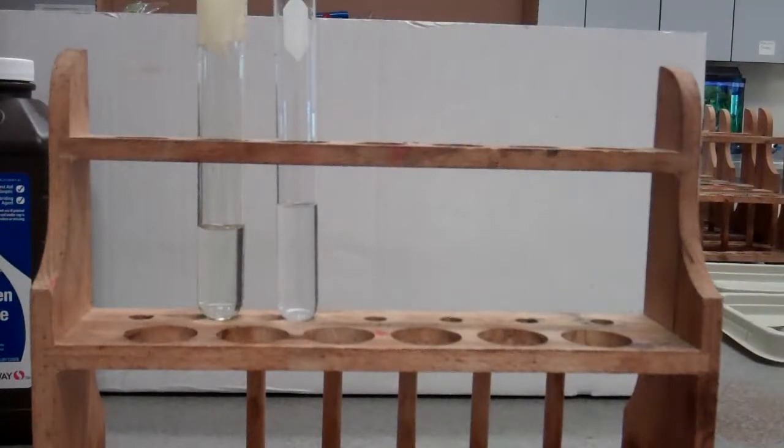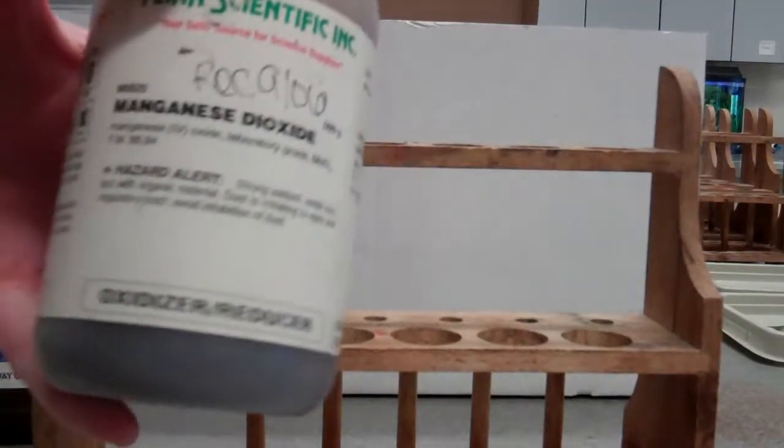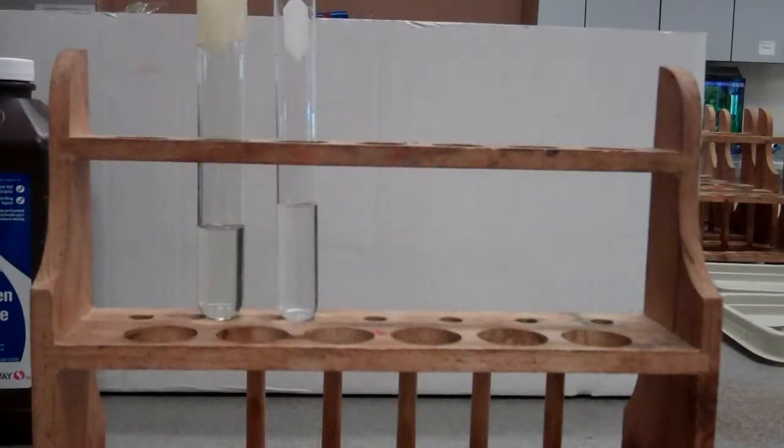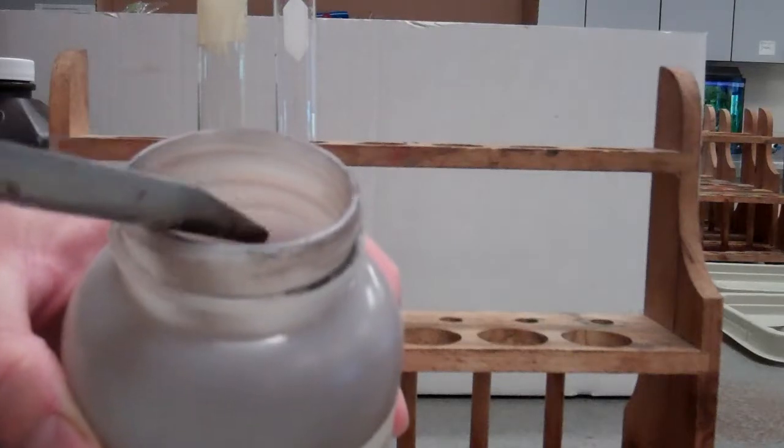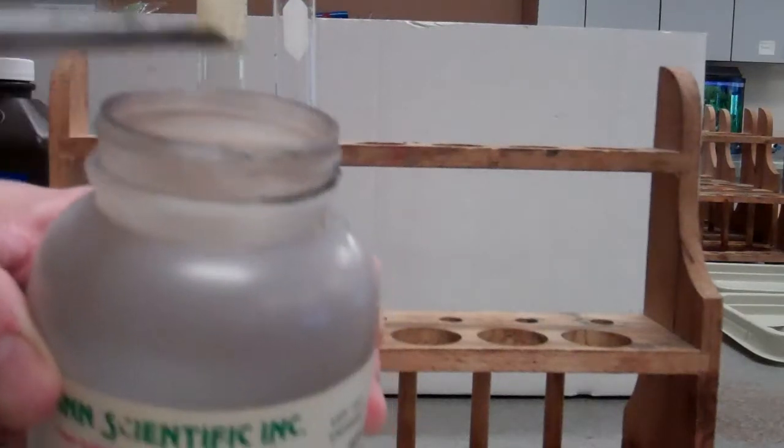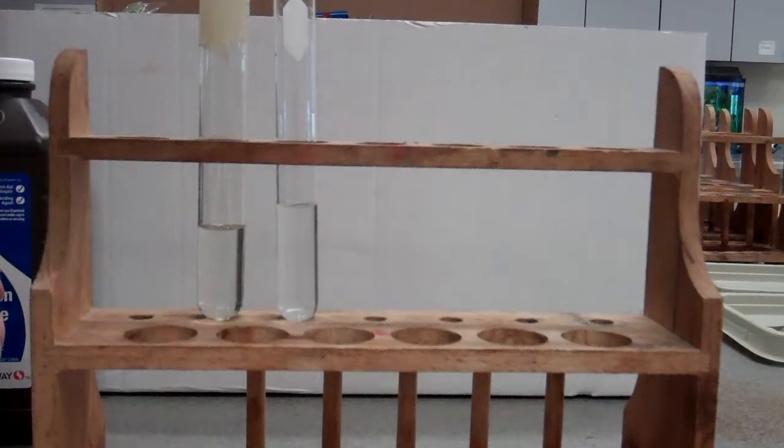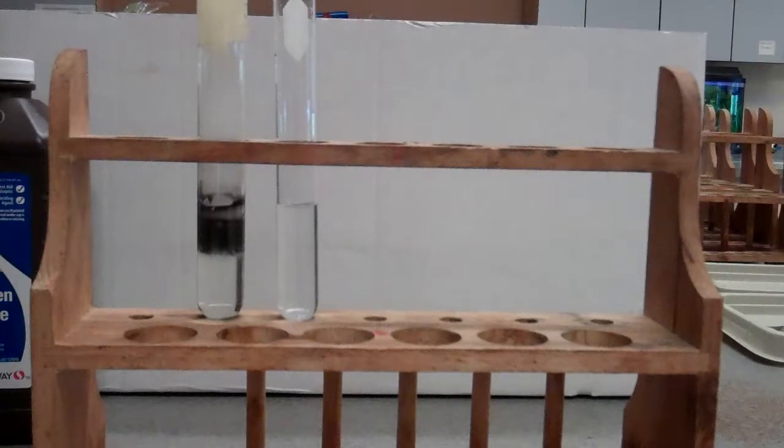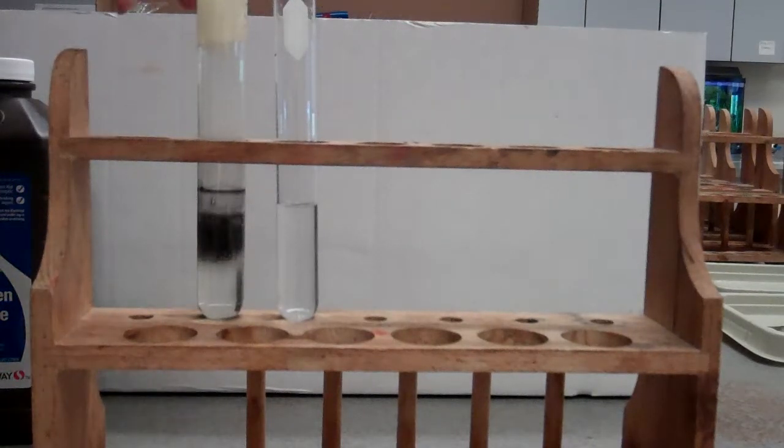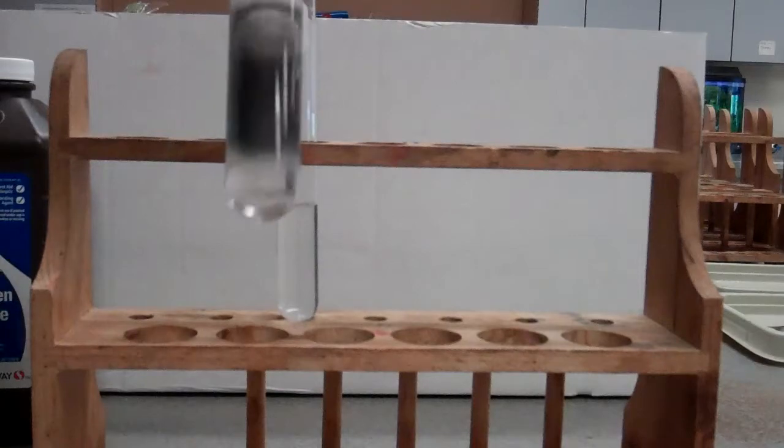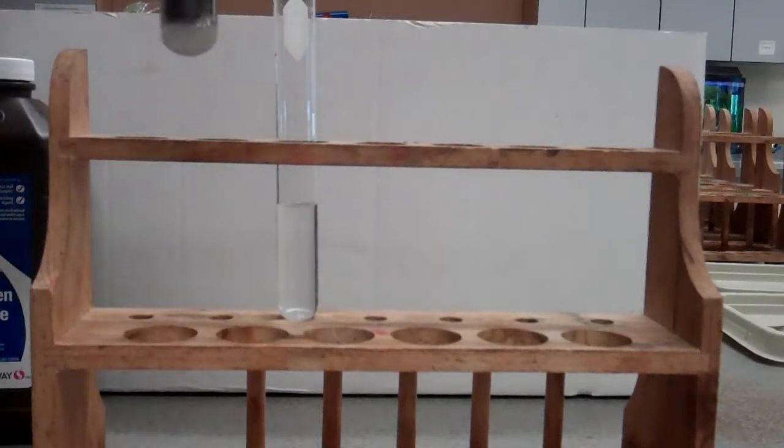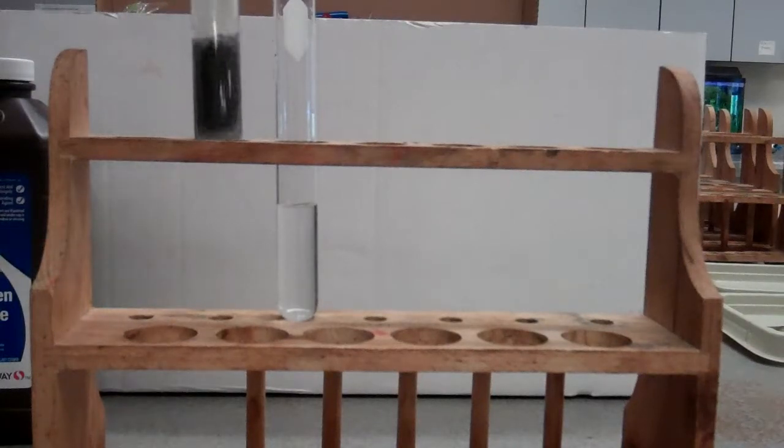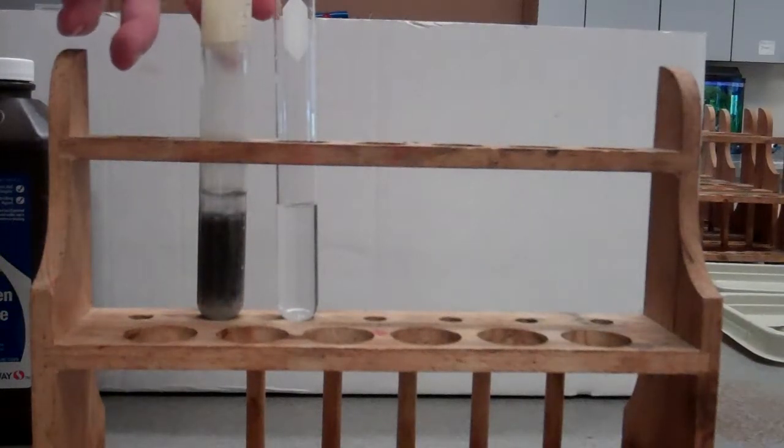The first thing we're going to do is we're going to add a little bit of manganese dioxide. It's black powder. This is a chemical catalyst. It's a chemical. We get it out of a jar. We're actually seeing some of the steam or smoke coming out of here.